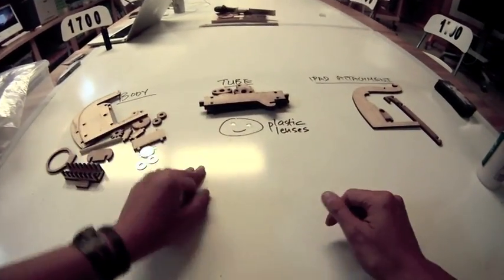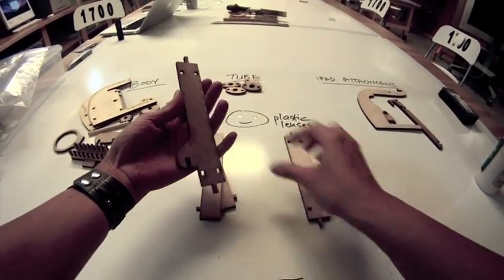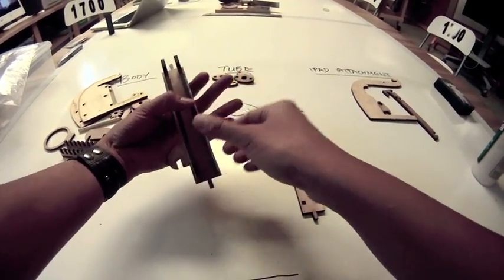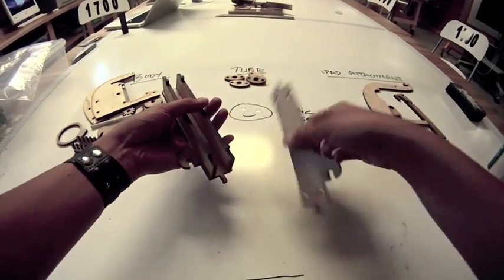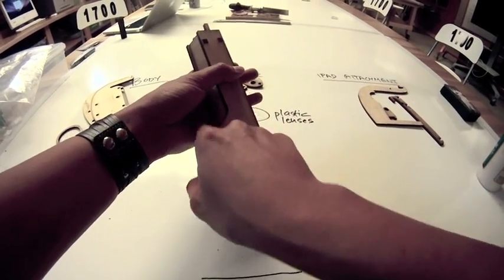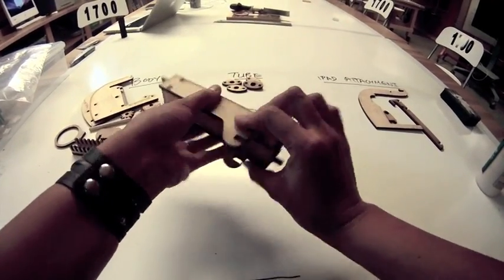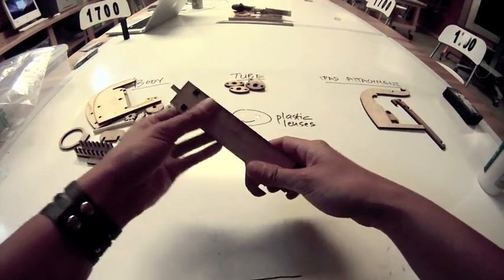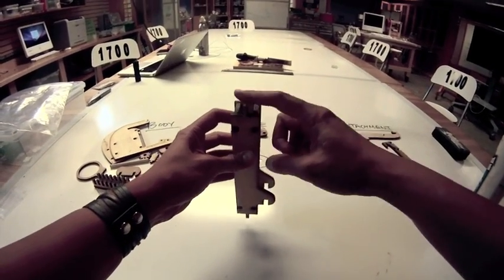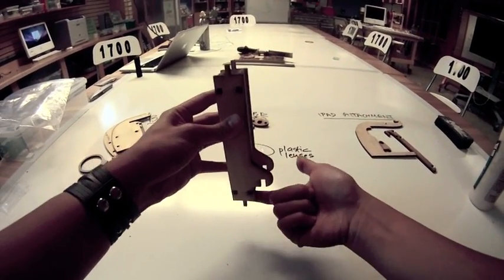Next we're going to work on the tube of the microscope. Take these four long pieces. First, take one of the pieces with the curved finger, and then the two long pieces without curved fingers fit on either side of it. The last piece goes on top and you make a long box. The only thing to pay attention to is making sure the two curved fingers are facing the same side. We don't need to glue this because we'll be putting pieces on the top and bottom to hold it together. The side closest to the curved finger is the bottom of the tube.